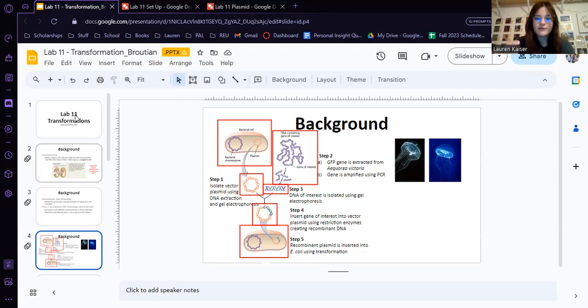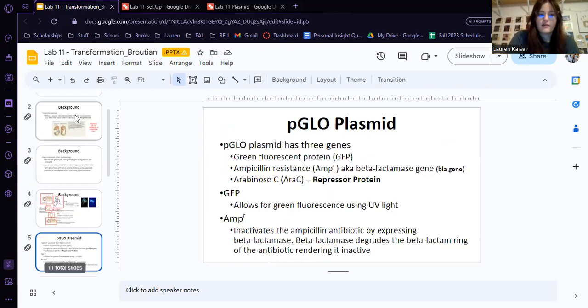It's kind of like when you give your dog or a cat, for anybody who has pets, a pill from the vet, you want to put that pill inside cheese or some kind of treat so that they're more willing to take it up and hold on to that. So think of that little bit of DNA that we want to put in as the pill, and then the cheese or whatever around it is the stuff that we add.